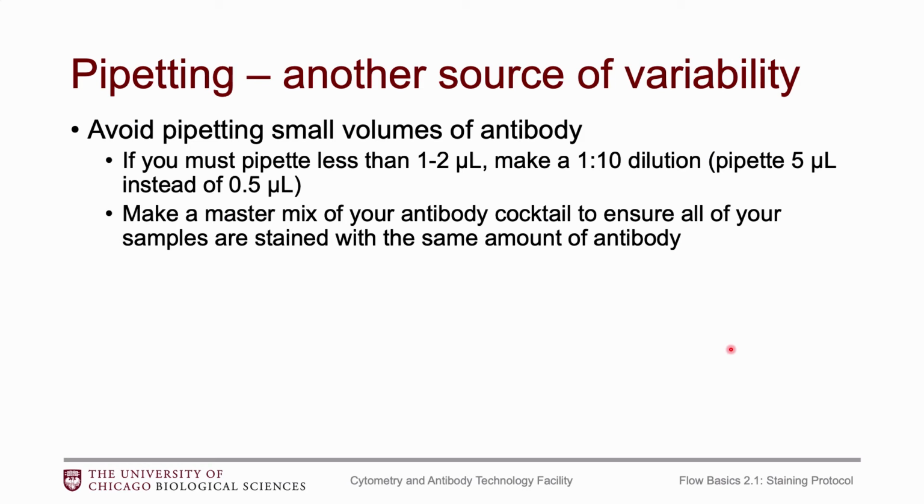Now, if you have multiple samples, multiple antibodies, then we do recommend that you make a master mix of your antibody cocktail, and that will ensure that your samples are stained with the same amount, and it will minimize the amount of pipetting that you have to do as well. So I'm going to go through a little example of how I might go about making a master mix and my actual protocol for mixing everything together.